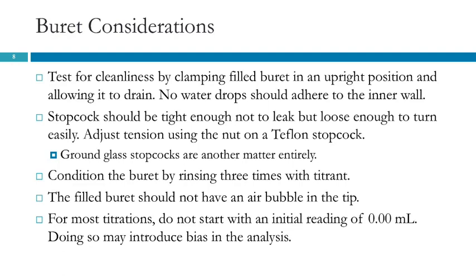So then when we do it again, we're left with less diluted sodium hydroxide. And we figure after 3 times, we'll call it good enough, okay? Just occurs to me that might be an interesting thing to test. What is the concentration after 1 rinse, 2 rinses, 3 rinses?